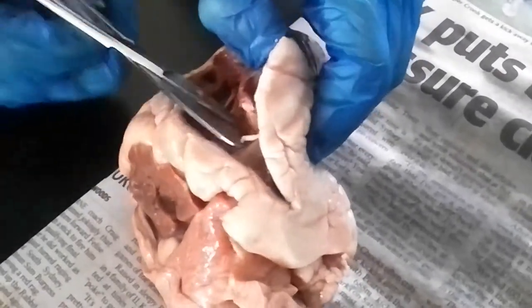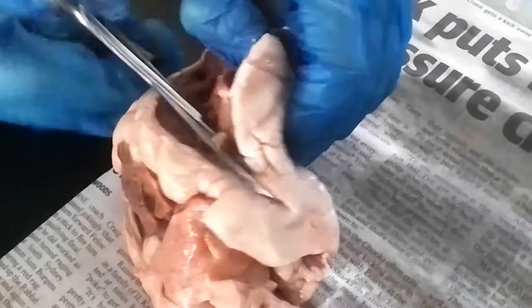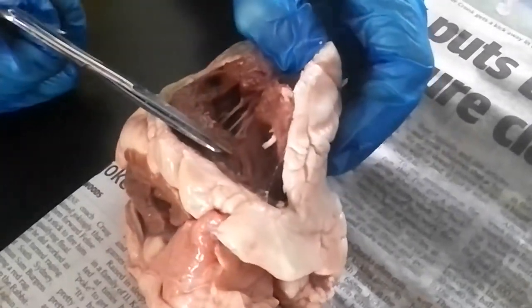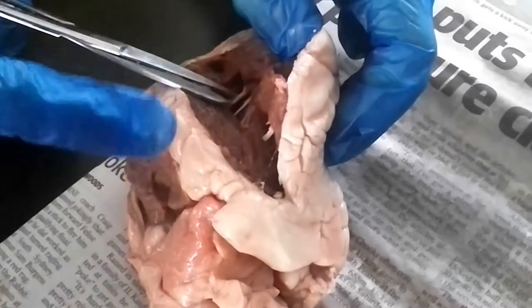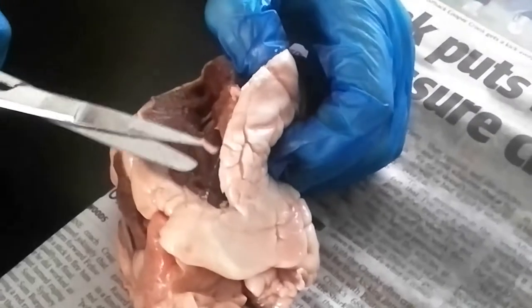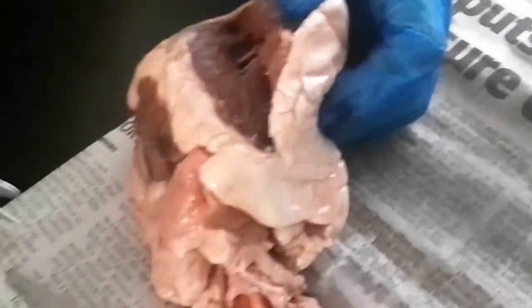So that is your bicuspid valve. See this thing here? What is that? Like a magnet or something. No, it's just like this tiny white thing. Oh, maybe cut a vein or something. So it looks like a maggot. Small atrium, really thin atrium at the top, and then really thick. Did it have a maggot?